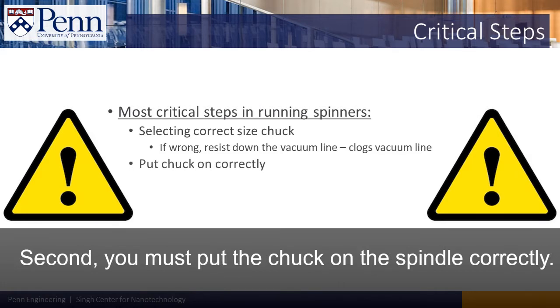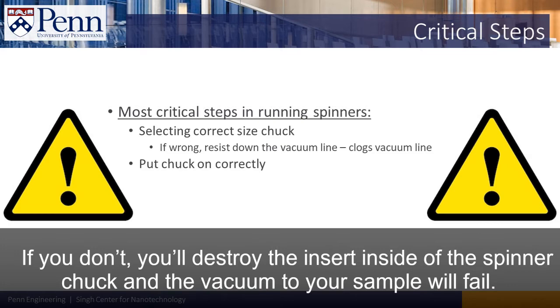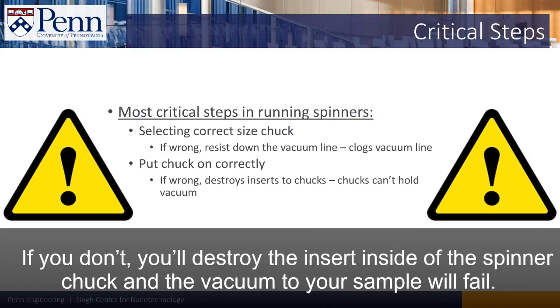Second, you must put the chuck on the spindle correctly. If you don't, you'll destroy the insert inside of the spinner chuck, and the vacuum to your sample will fail.